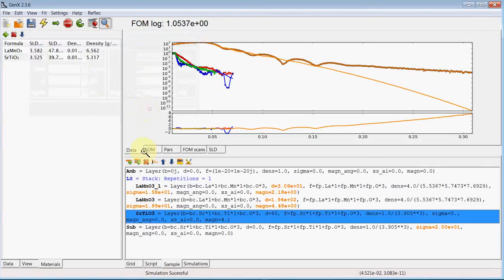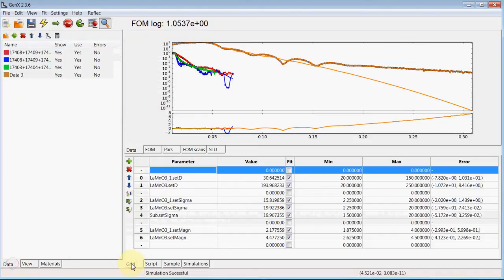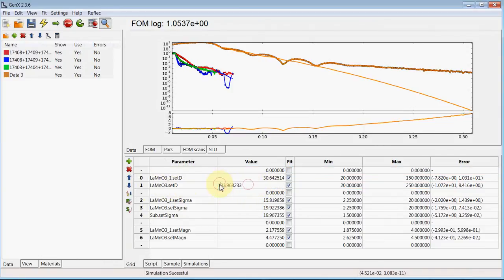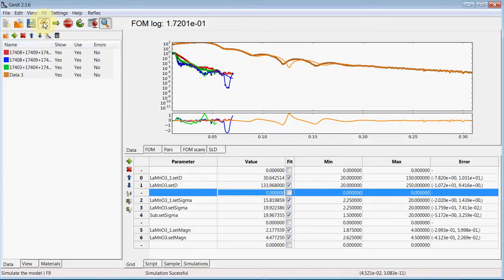To compensate for this additional magnetic thickness, we reduce the LMO layer thickness by the same 60 angstroms, so this is 134. Now we can simulate again and as you can see, the thickness of the X-ray data now looks much better.